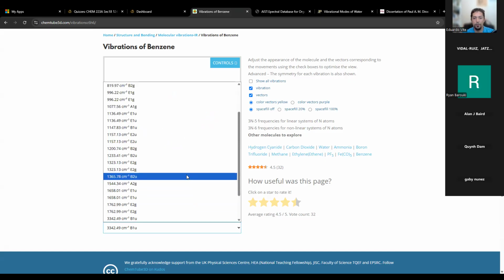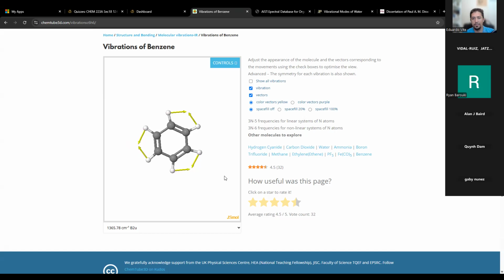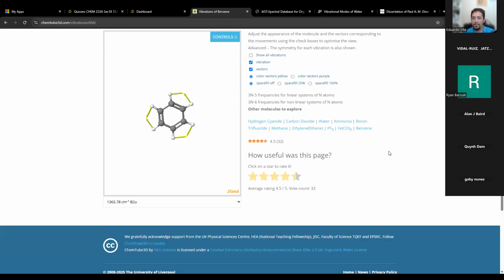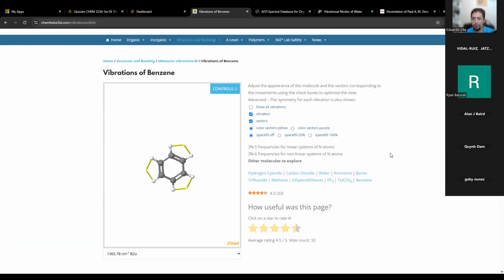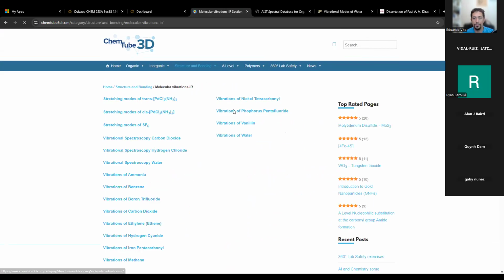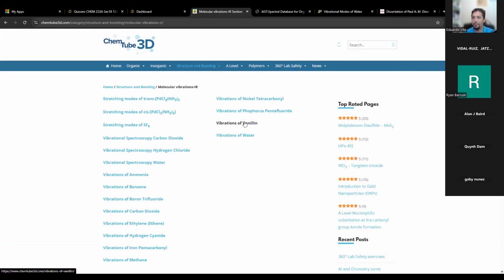And again, you can just go and see all sorts of motions. This is like a weird bending motion that happens there. Yeah, CHEM223A, really great website. I'm gonna post it in the announcements. Make sure you play around with it because it's a very beautiful website, very nice. It comes from real data, so this is actually what is happening. Let's look at one more.